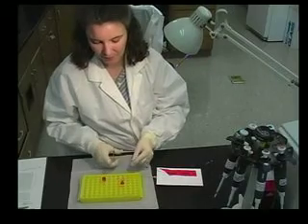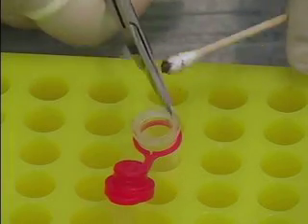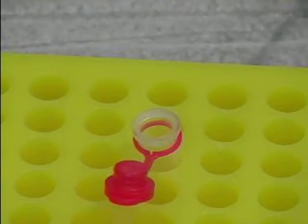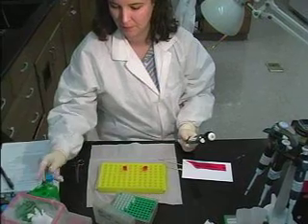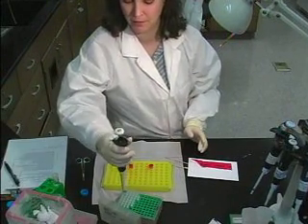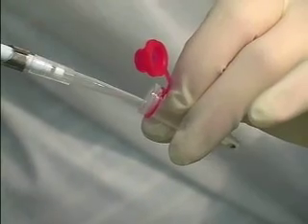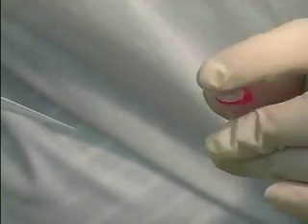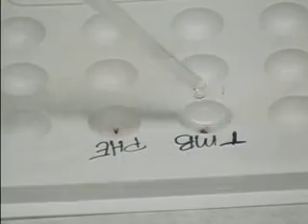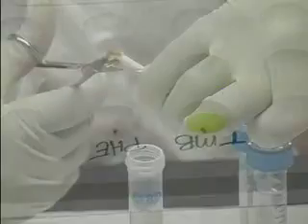The forensic biology section performs tests to determine the presence of body fluids such as blood, semen, and saliva. These examinations are chemical tests that react with certain components of the body fluid. For blood, 2 tests are used. The item is typically swabbed to remove a portion of the stain or cut and placed in a testing tray. Once the chemicals are added, a color change will immediately occur if positive.